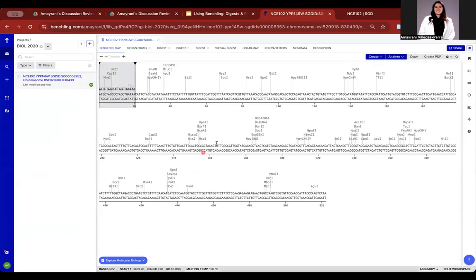What your primers are doing is they're amplifying this gene. So that means you need primers that can recognize the beginning, and you need a primer that's going to run from the end back inwards. Why do we want it to go from right to left? It's because if you did it the other direction, you wouldn't actually amplify this gene. Your primer would be running left to right. So it would be anything that's downstream, and you don't want that. So for now, we just did our forward primer, super easy.